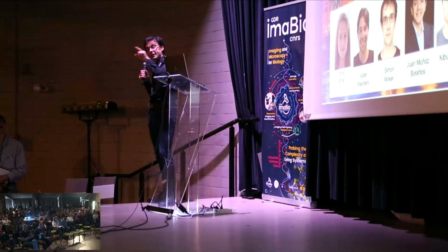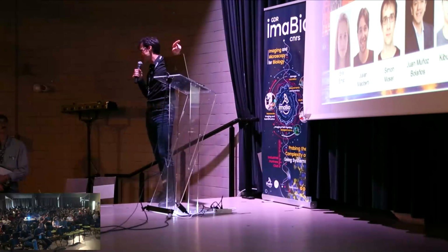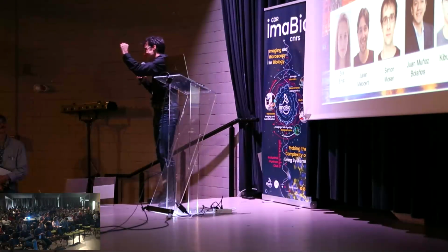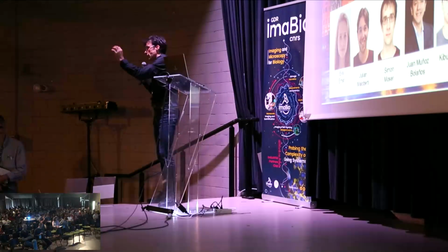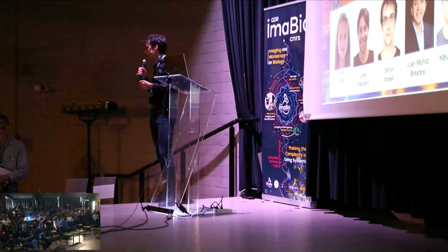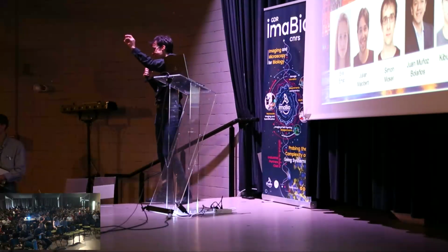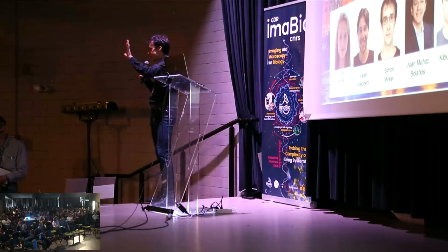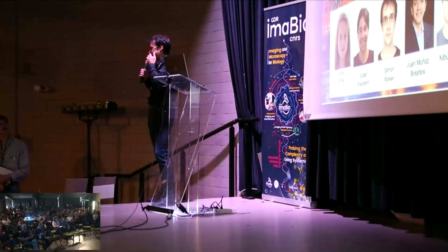And then very quickly, it was actually a GIF that unfortunately didn't work, you see one speckle win, and then all the energy will go there. But I don't know where that speckle will be. It's a combination of where my fluorophore density distribution is and how my scatter pattern, my speckle pattern, looks. Once the speckle is there, I can scan and I will get an undistorted image. But there is an unpredictable slight XYZ shift that I cannot really control.